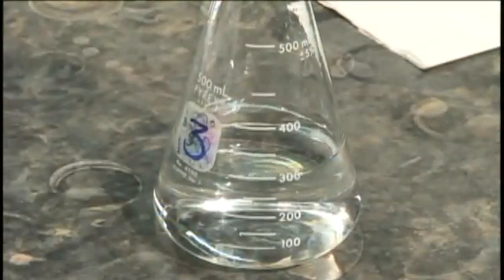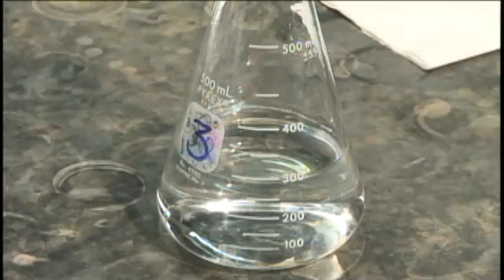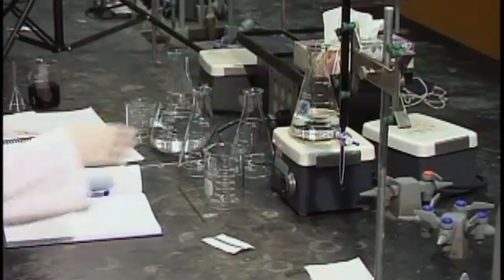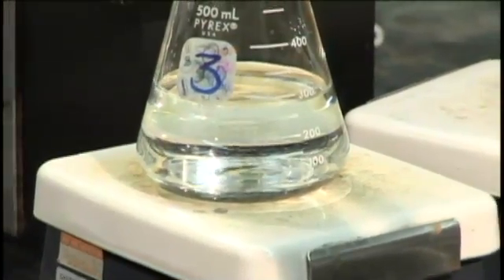So in step 6, we added KMnO4 to our 90% consumption, and then we swirled it until the solution became colorless again. In step 7, we're going to heat up our solution to about 55 or 60 degrees, and then we'll complete our titration going drop by drop until the solution becomes pale pink in color.